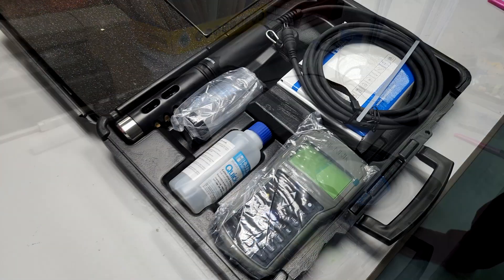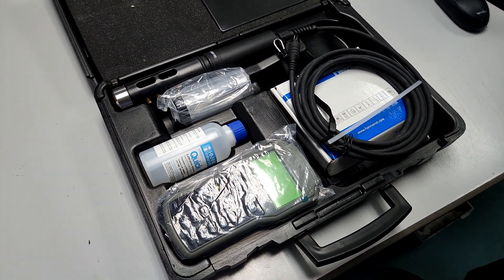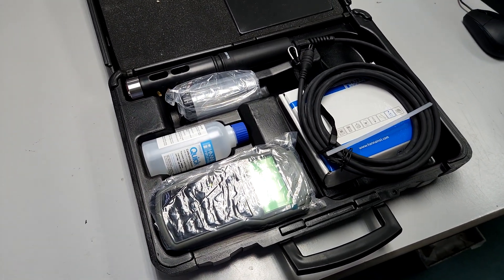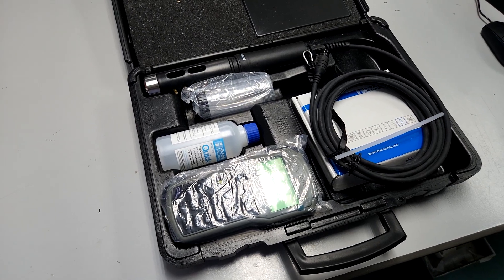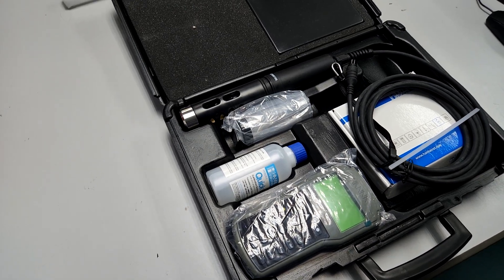We have actually used this model in our earthen pond setup and it's quite reliable — we've been using it at least three times a day for two to three years. So we decided to proceed and get the same probe we have good experience with.